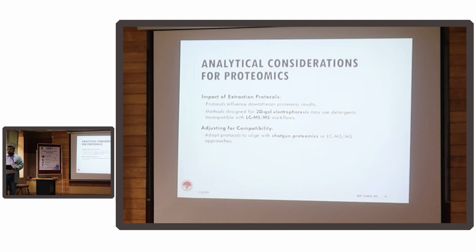Don't do that. Those are two different technologies, although both are specific for proteomics. You don't use something that is developed for 2D for LCMS.